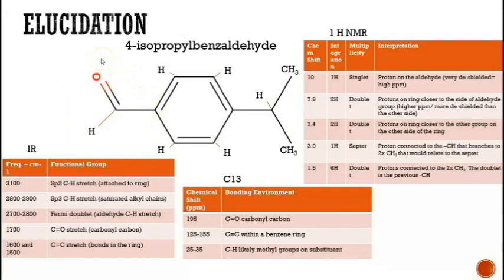We saw the carbonyl carbon stretching right here. We had also seen that there was going to be some saturated alkyl chains, which we see over here. And the CH, that is the aldehyde CH, all the way over here.